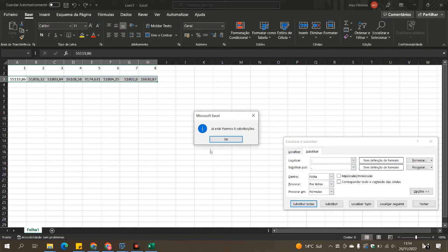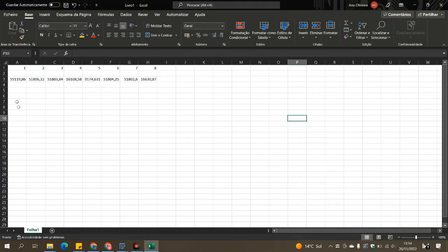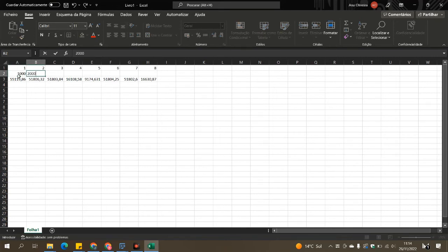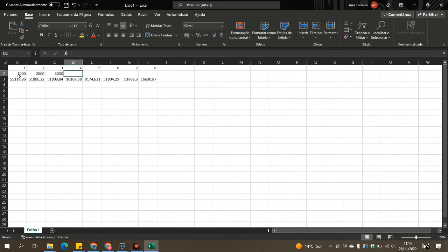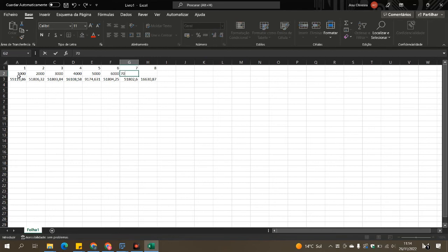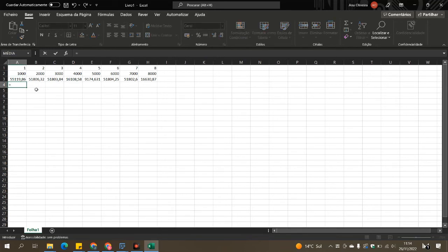After we do the ratio between our target protein and our loading control, we will normalize all the values to the control by dividing all the ratios by the ratio on the control group.